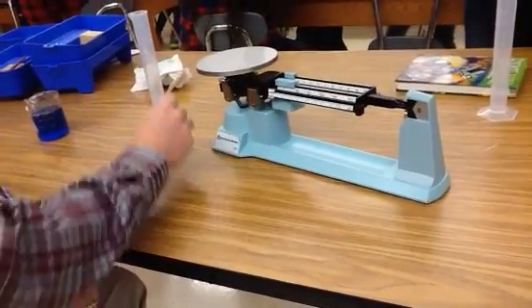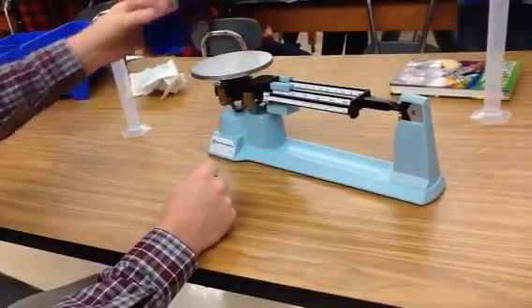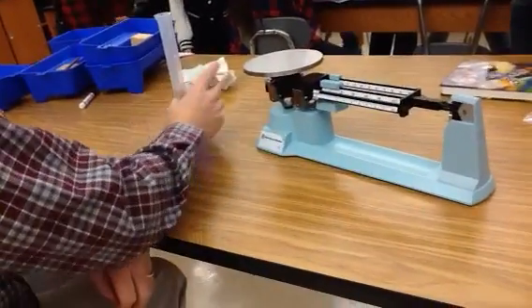Now we are going to have to find the mass of a liquid. The only problem is I cannot take a liquid and pour it right onto the scale. So we have a little problem here, don't we? What are we going to do to fix this problem?